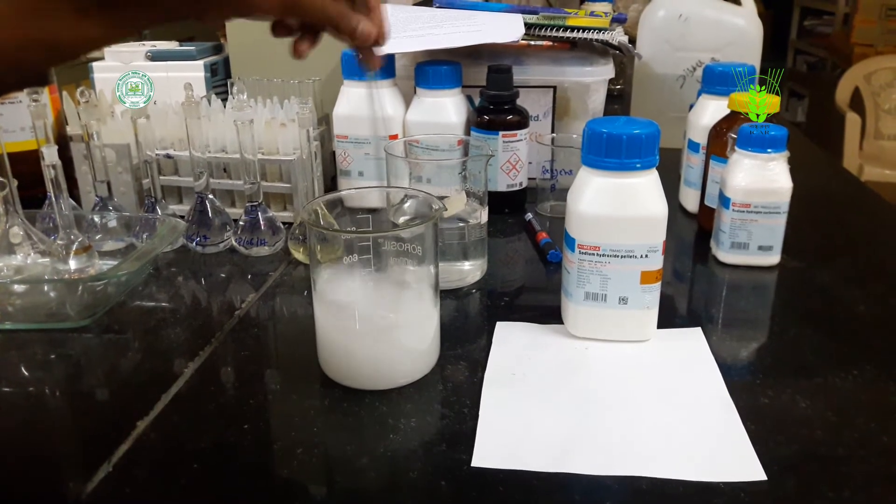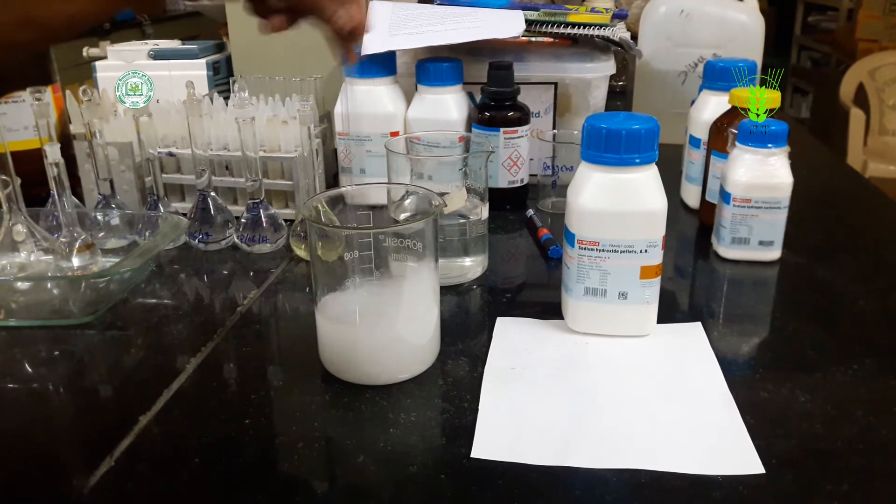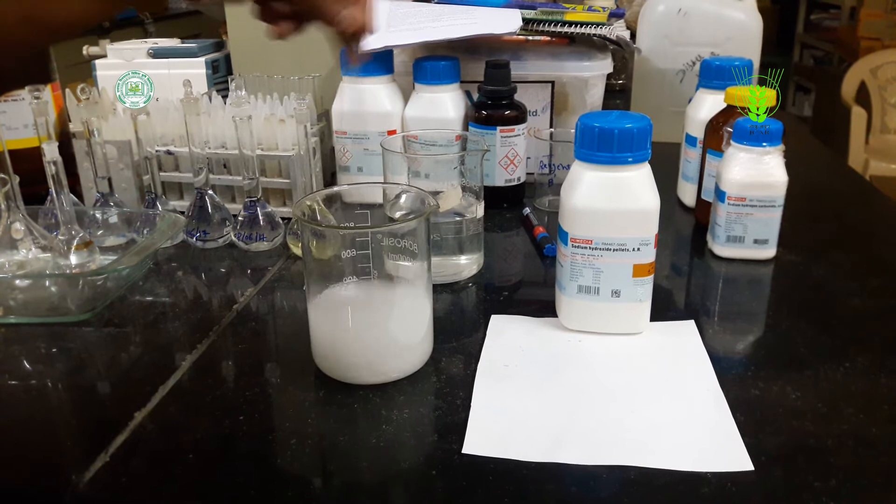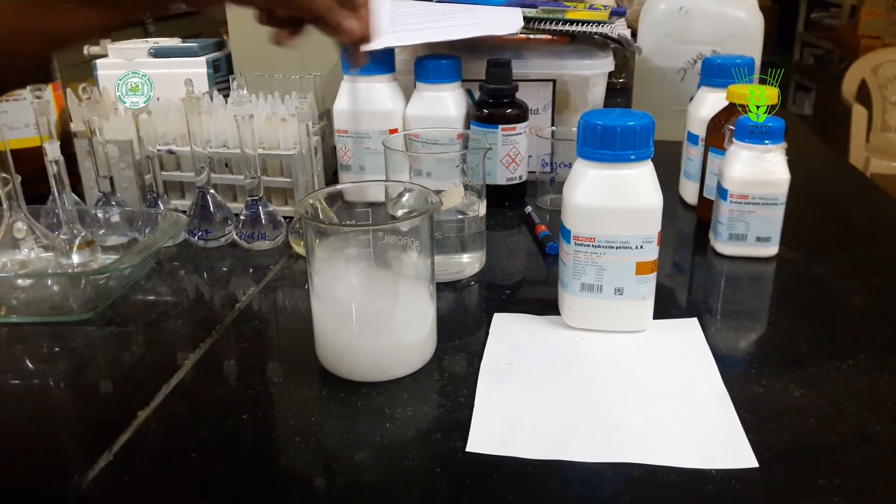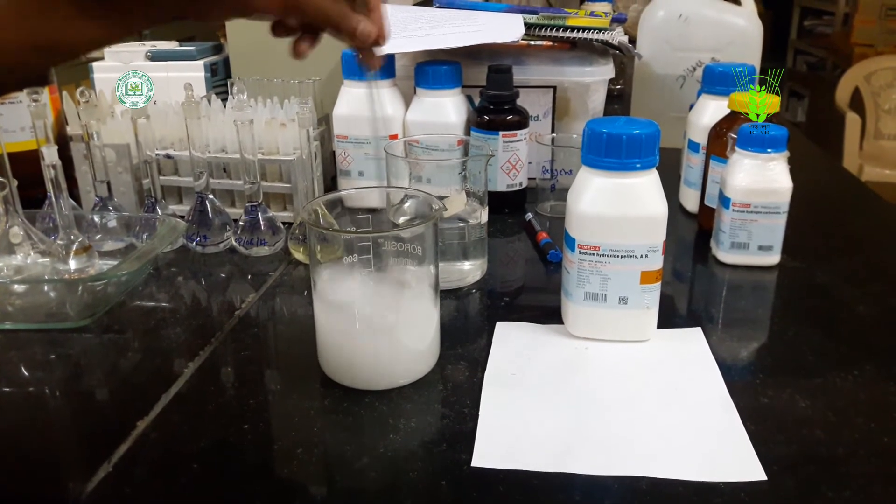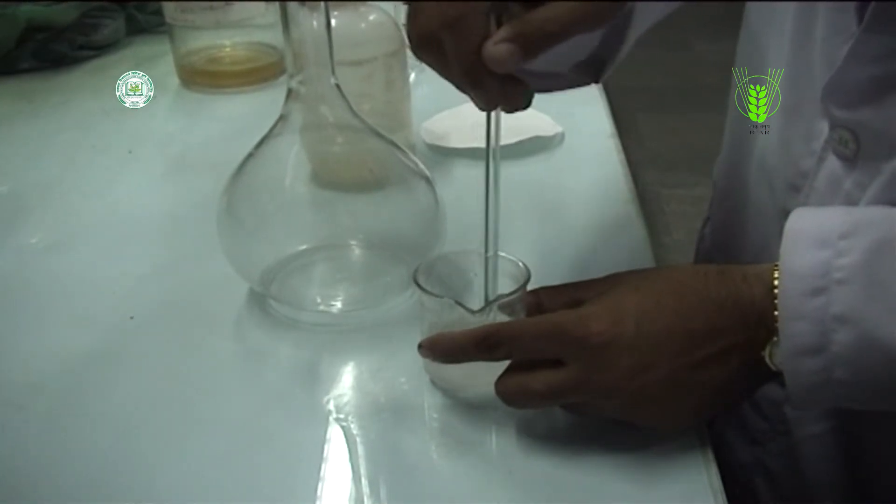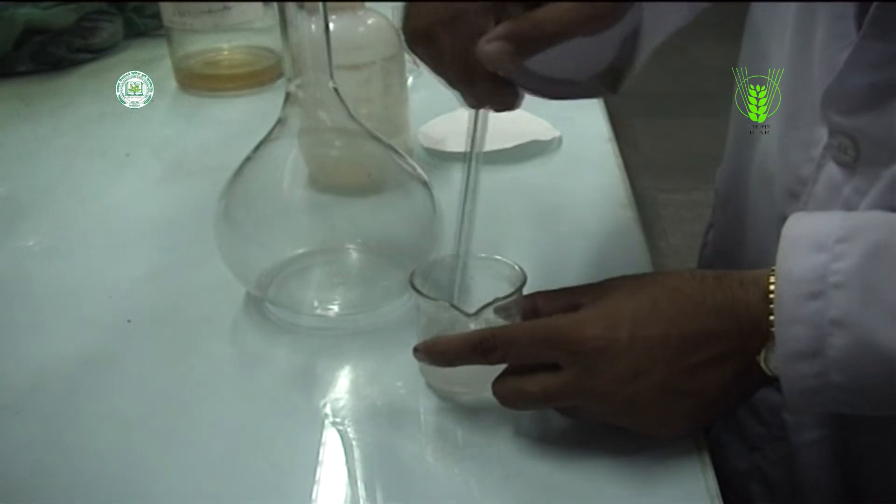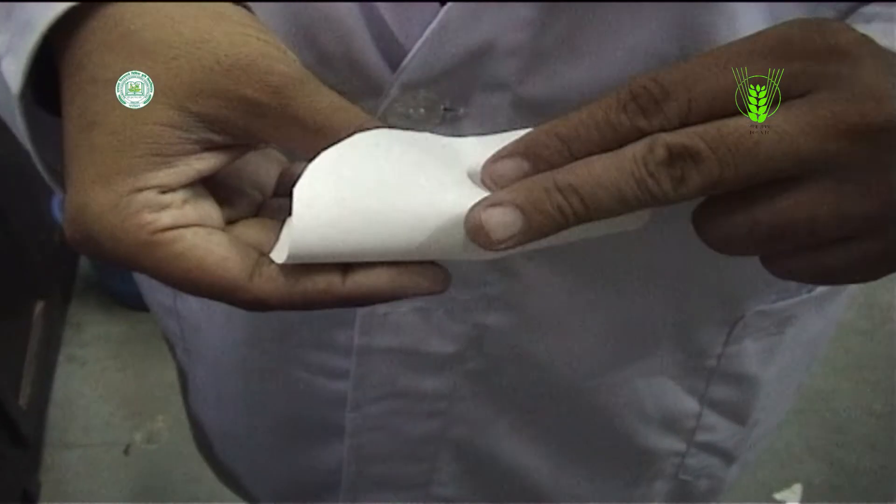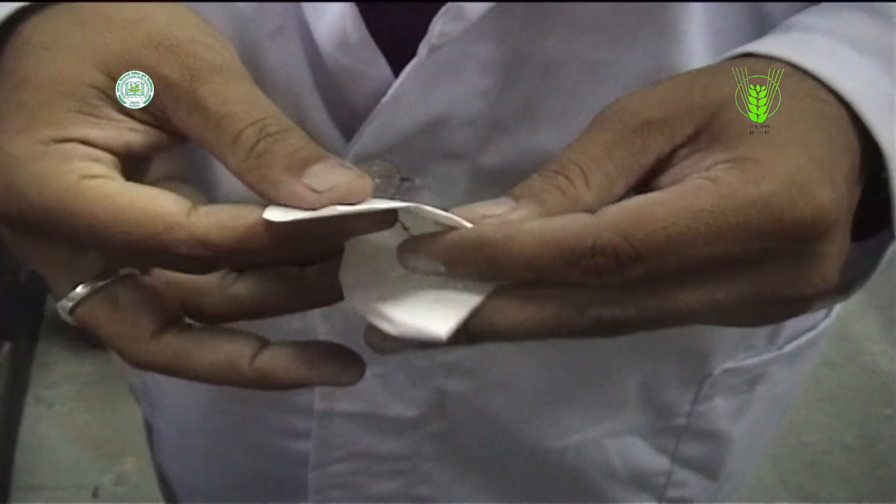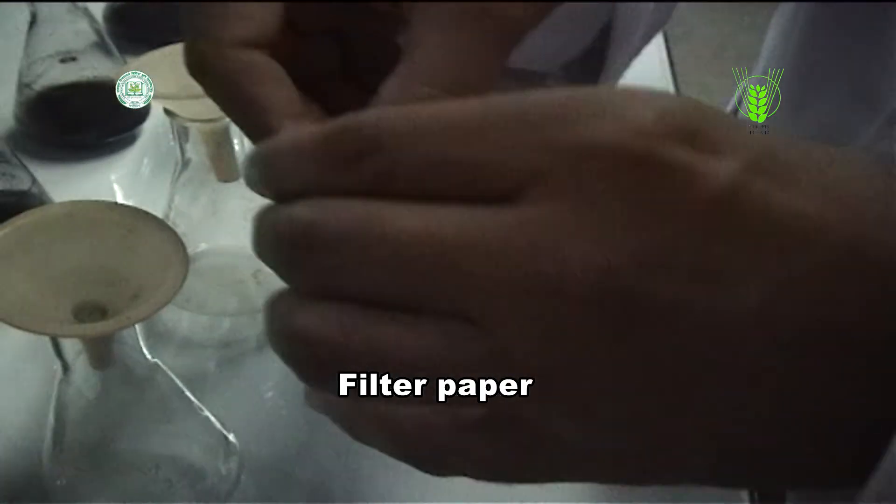Stirring rods are used to mix chemicals and liquids for laboratory purposes. They are usually made of solid glass about the thickness and slightly longer than a drinking straw, with rounded ends like most laboratory glass. Stirring rods are made up of borosilicates commonly known as Pyrex. Filter paper. This is filter paper used for filtration of solution.